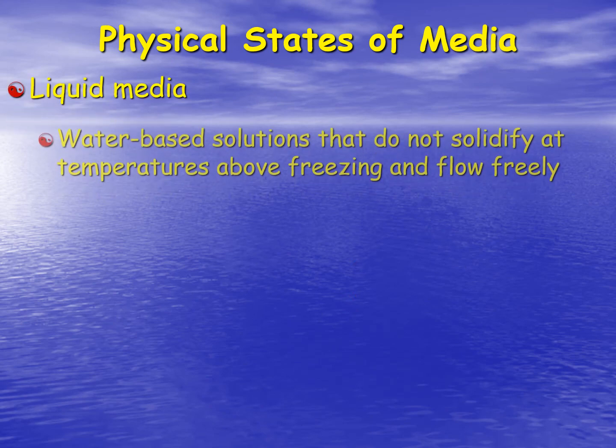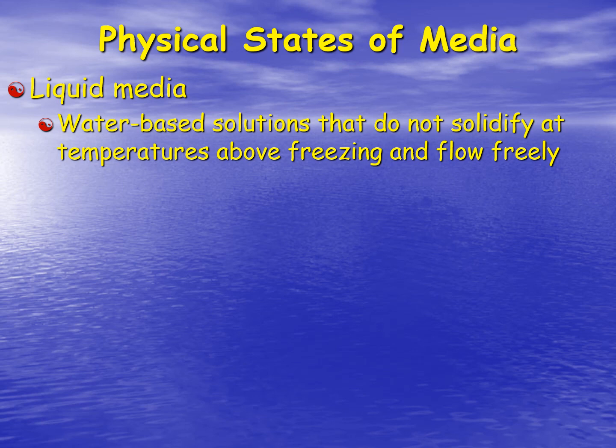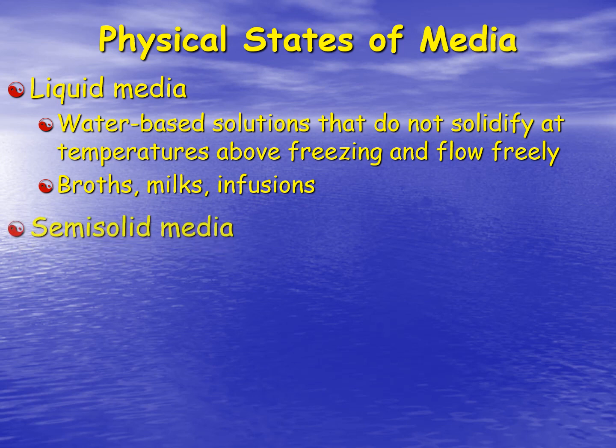So, liquid medias. These are water-based solutions that do not solidify at temperatures above freezing and flow freely. Most of the liquid medias that we use in the laboratory will be in test tubes with push caps on them. The push caps will allow oxygen to enter into the interior of the tube. Be aware that these push caps do not seal the tubes, so do not pour the E. coli tube upside down because you're going to have leakage. Liquid medias include broths, milks, and infusion medias.